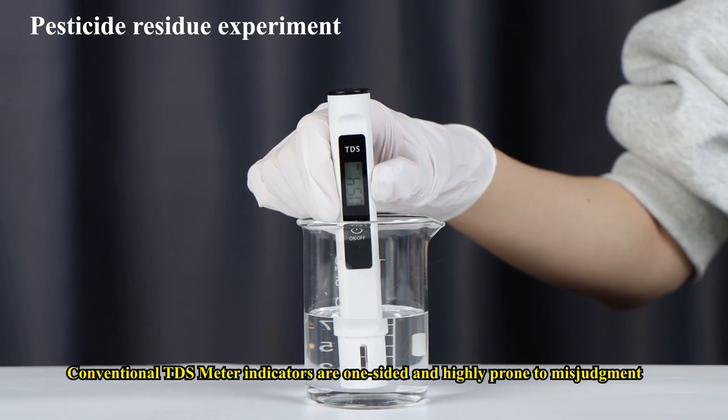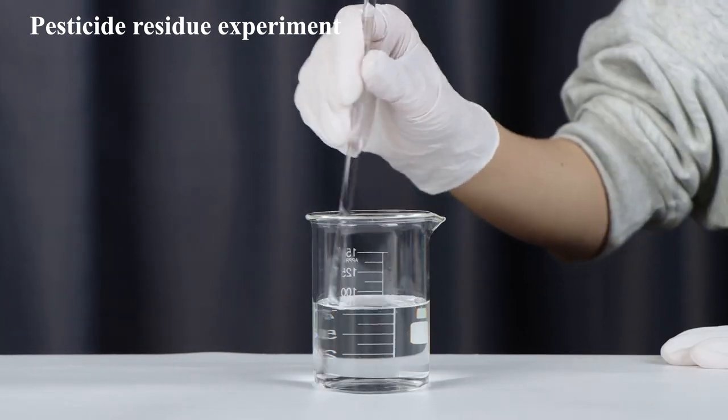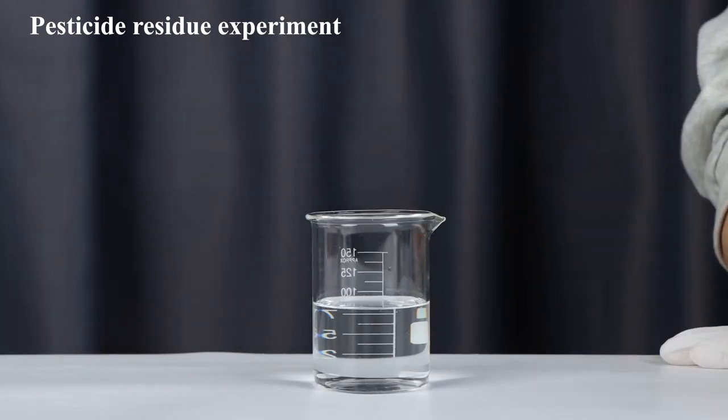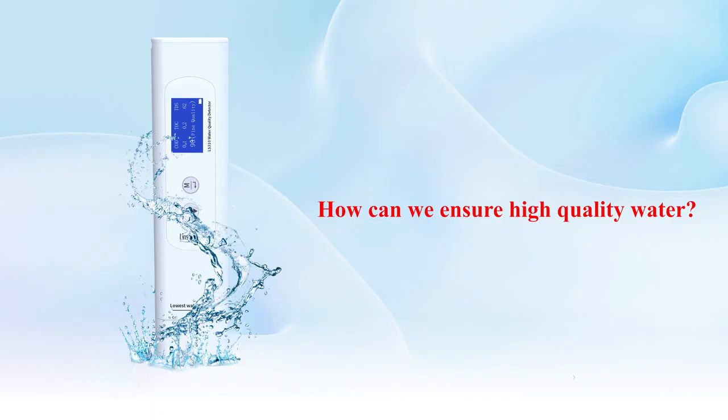Conventional TDS meter indicators are one-sided and highly prone to misjudgment. How can we ensure high-quality water?